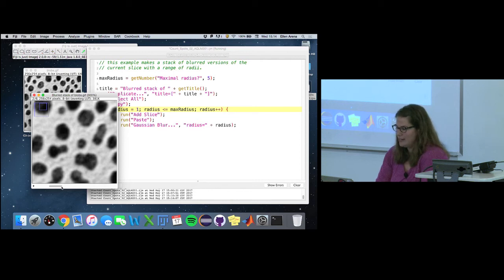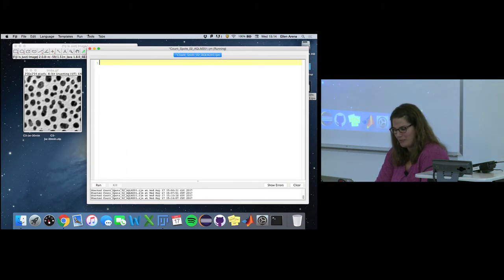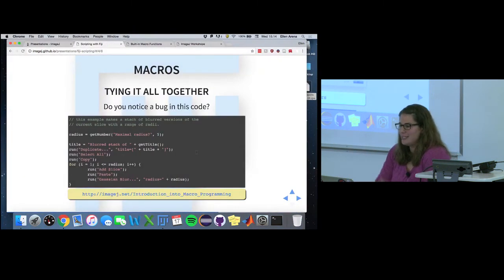Okay, let's move on because we got to get to the good stuff. Not that this isn't good. I think this is very helpful, and you will find this helpful later on, but let's get to batch processing. Oh, first, script parameters. Silly me. Let's talk about script parameters.